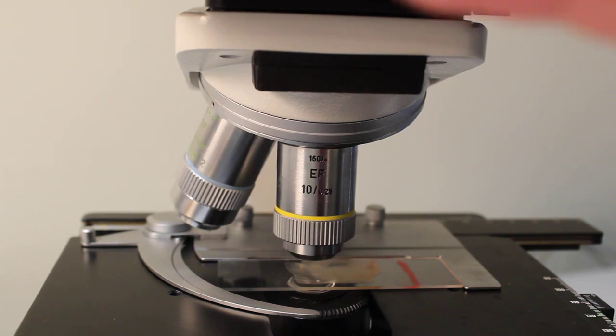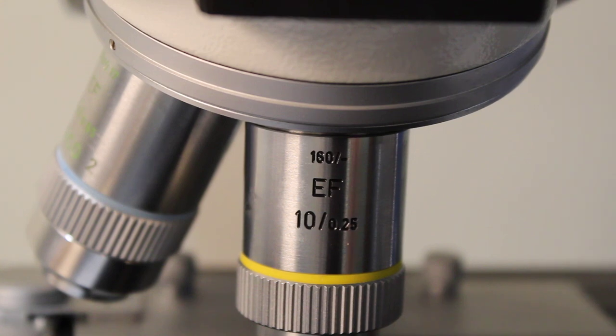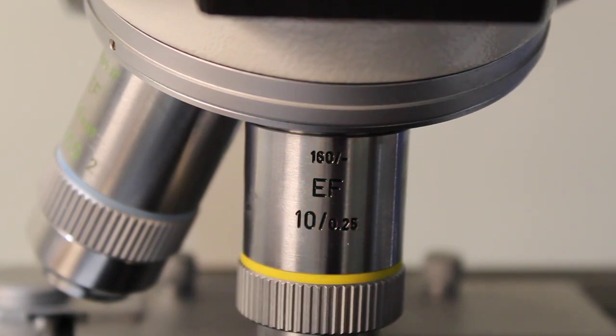Now when it comes to these lenses there are two values that you need to know. The first is the magnification which on this lens is the 10. So this is a 10x magnification and that tells you how much larger your sample will be or your object will be when viewed through that lens.